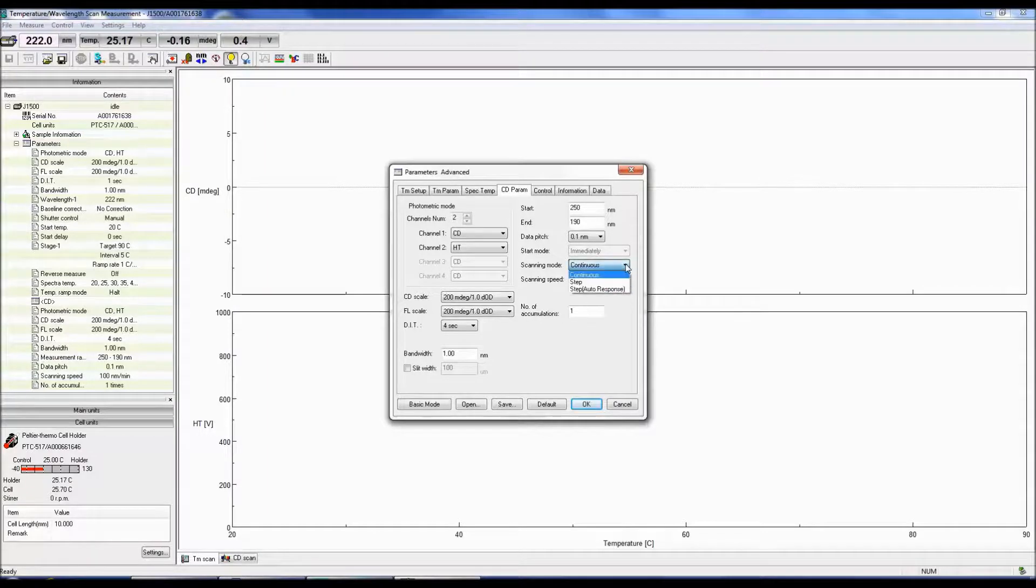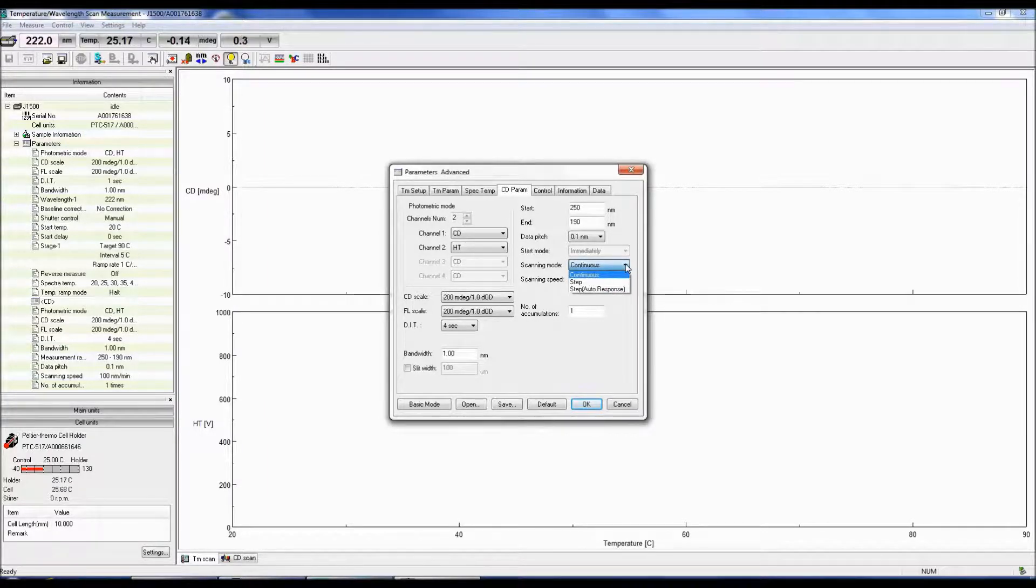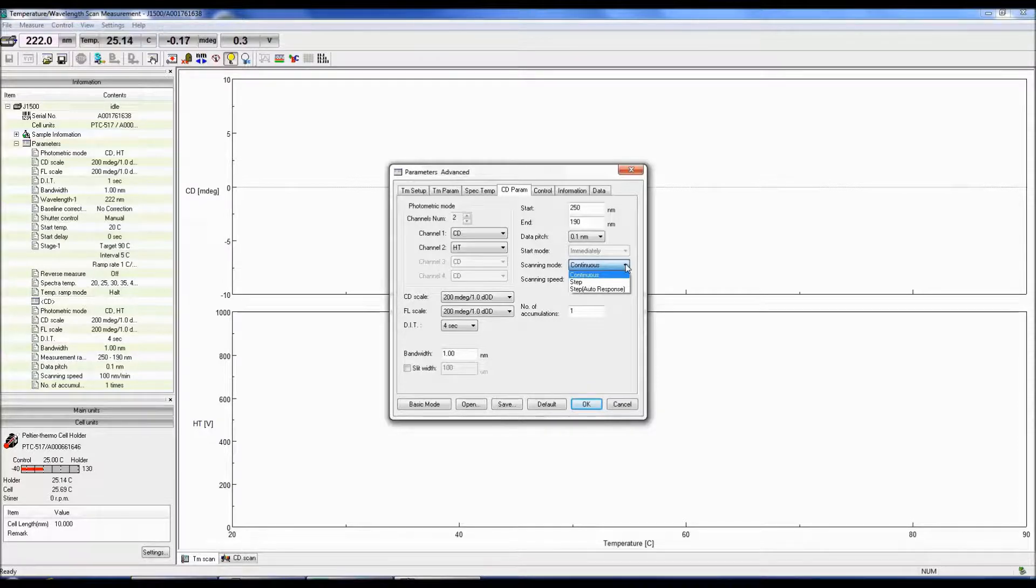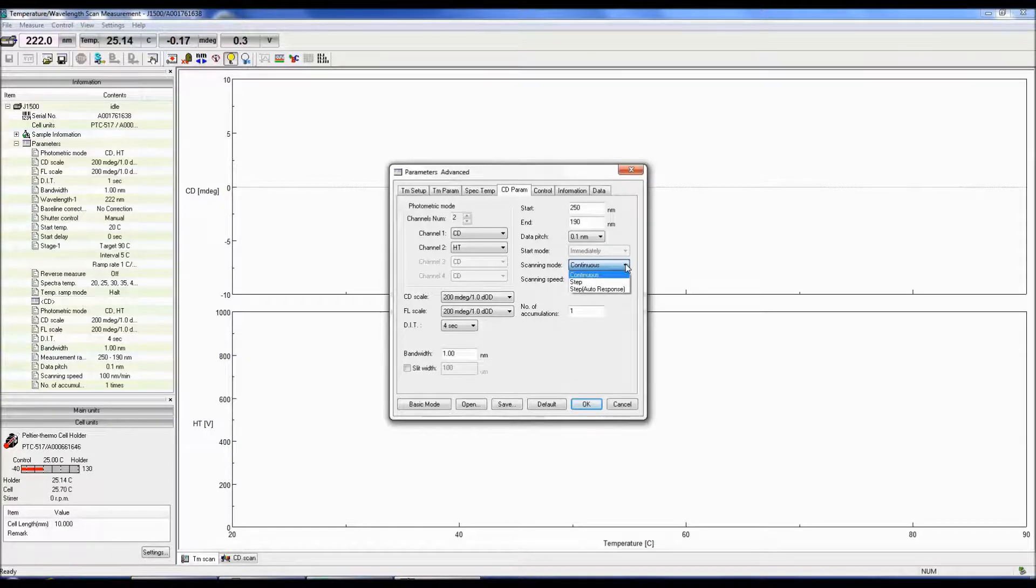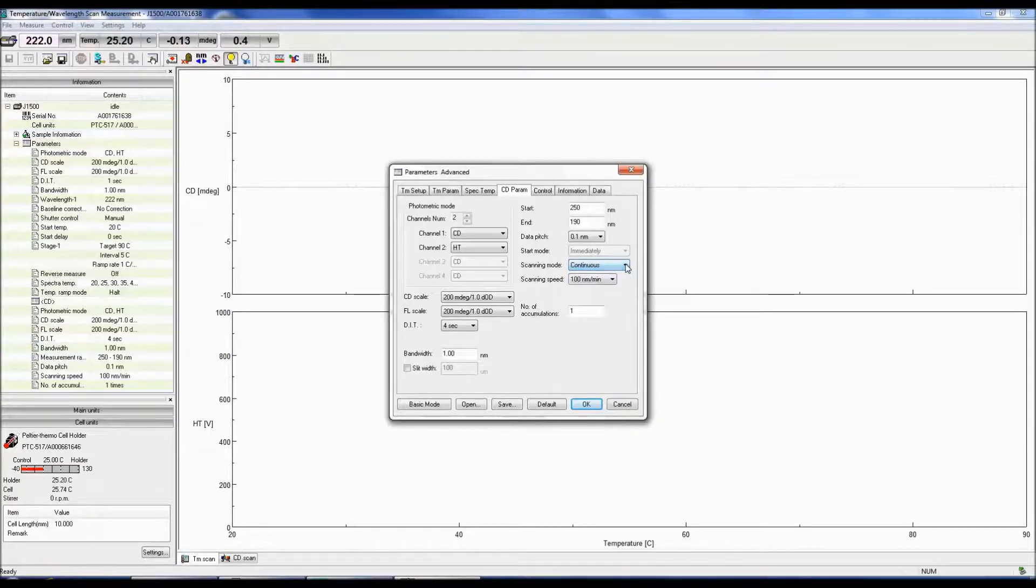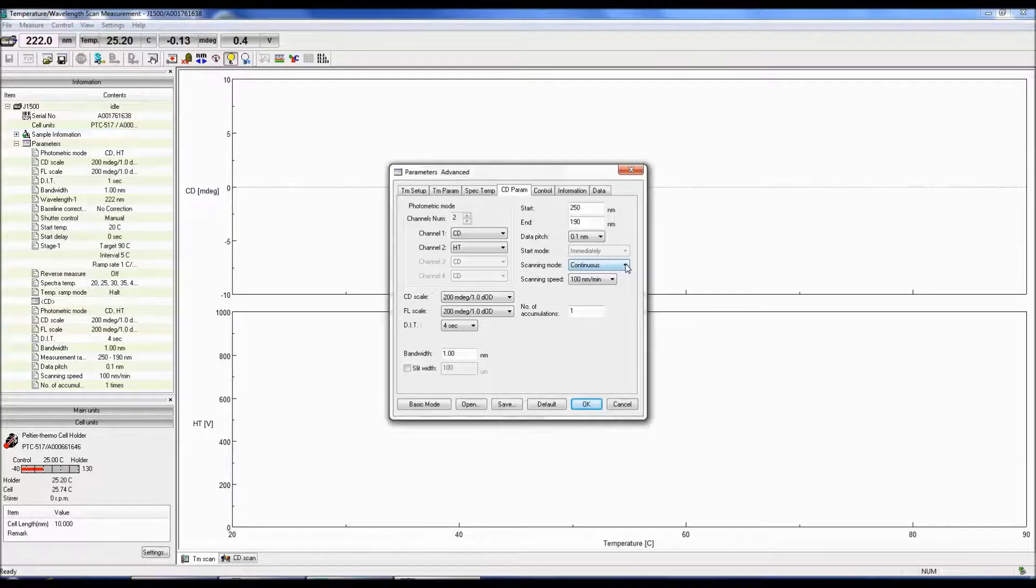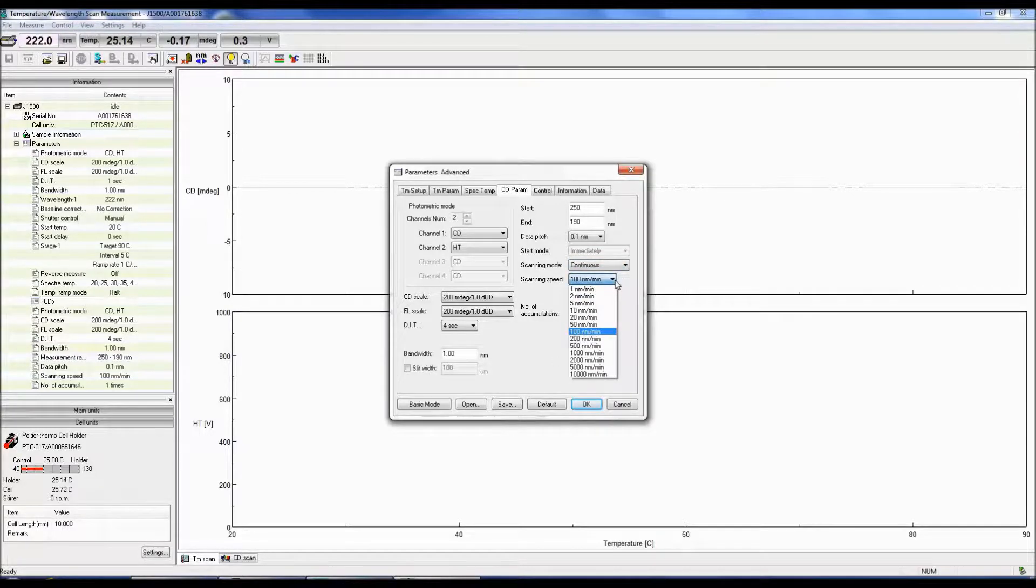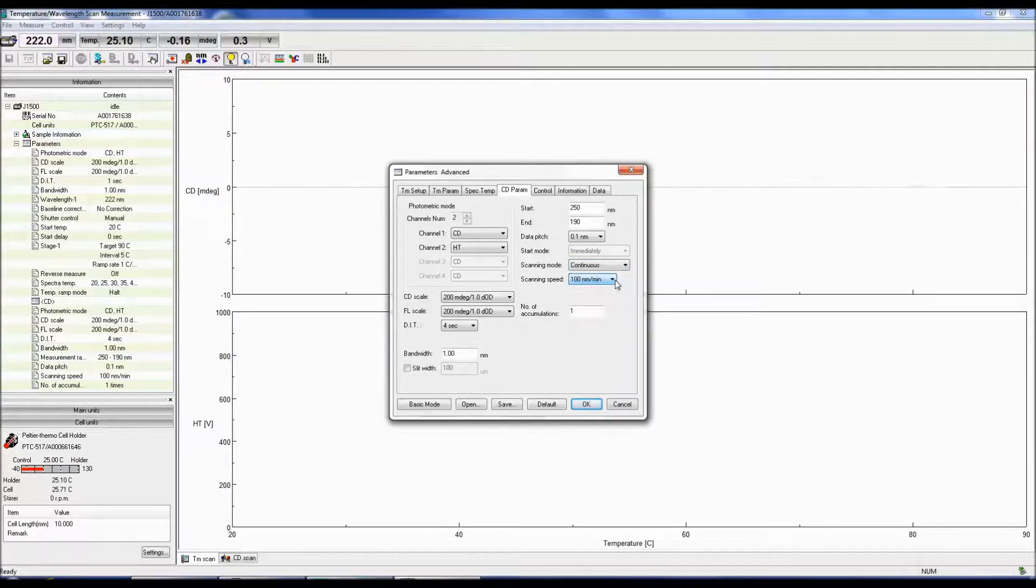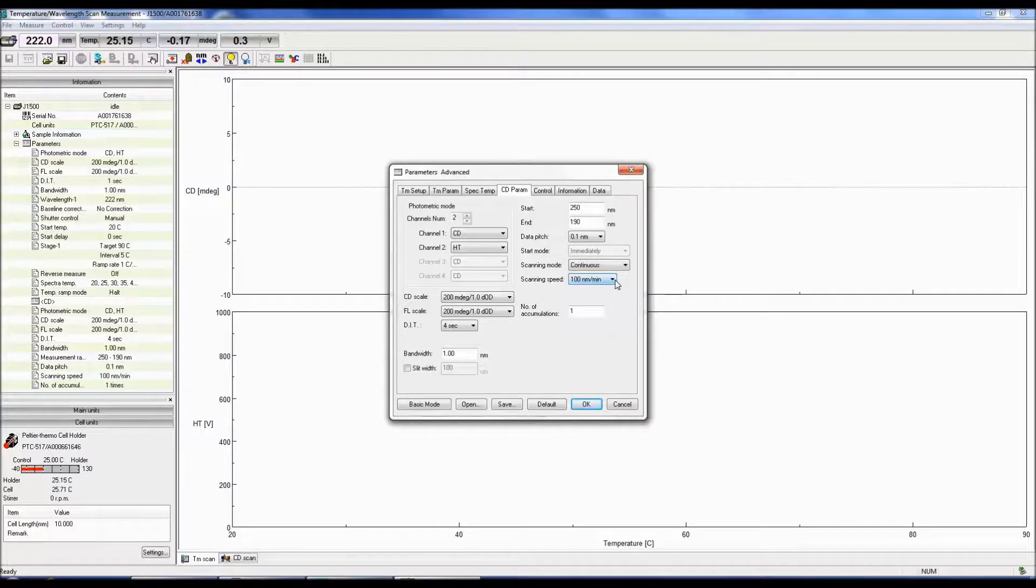JASCO offers three scanning modes. The Continuous Scan acquires a CD signal at each wavelength while moving across the desired wavelength range. Step Scan stops the monochrometer at each wavelength to obtain a CD signal. The Step Scan takes much longer to acquire a CD spectrum than the Continuous Scan mode. The scanning speed is the speed at which the data is collected. 50 nm per minute is a good scan speed to begin with.